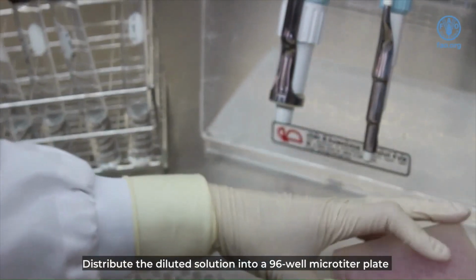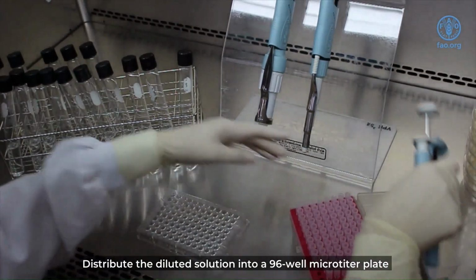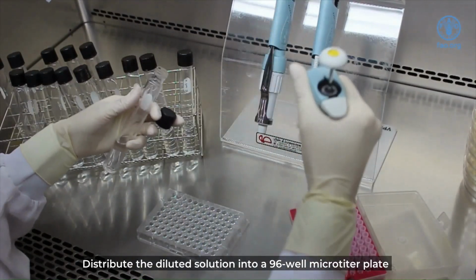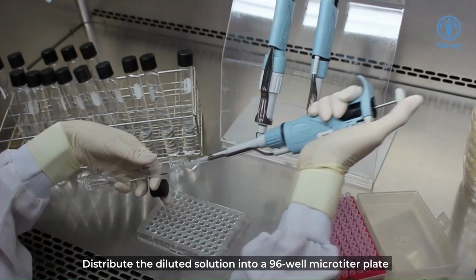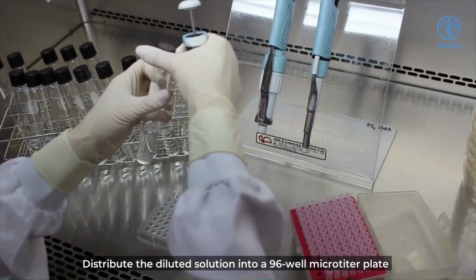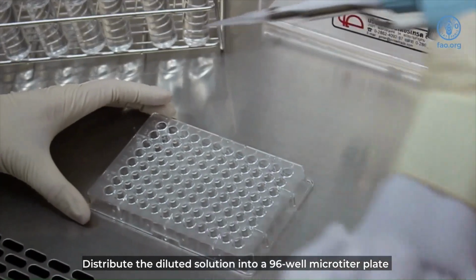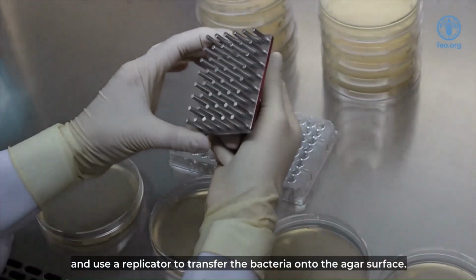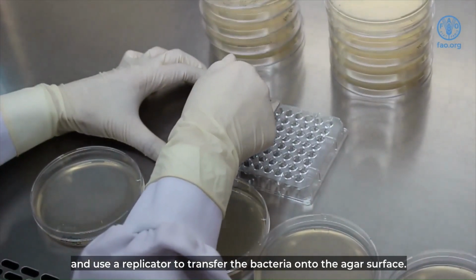Distribute the diluted solution into a 96 well microtiter plate, and use a replicator to transfer the bacteria onto the agar surface.